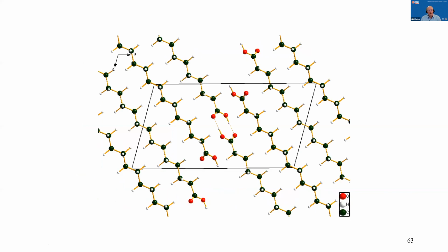From the shorter chain ones, you know the structures are going to be something like this. And so the strategy I used, which turned out to be more difficult than it sounds, because of course the cell gets longer with longer chains, was to orient it this way so that the chains are basically zigzagging in the plane. We have hydrogens up and down.